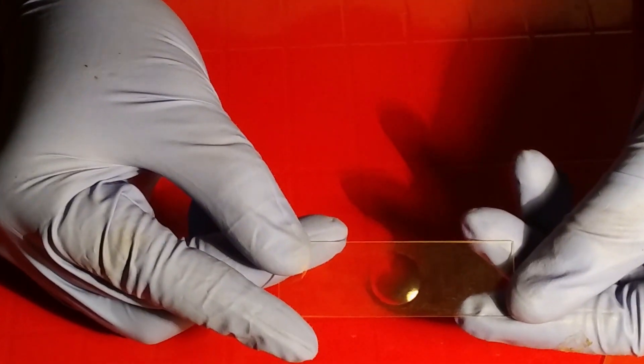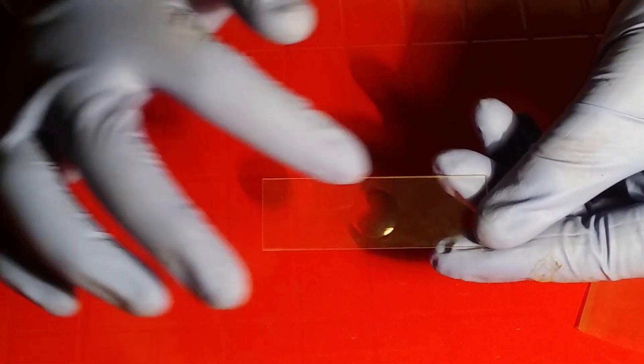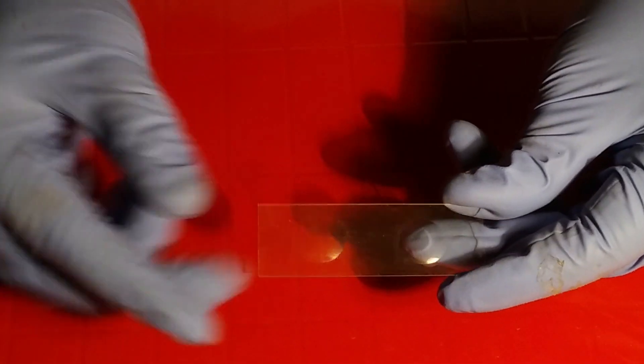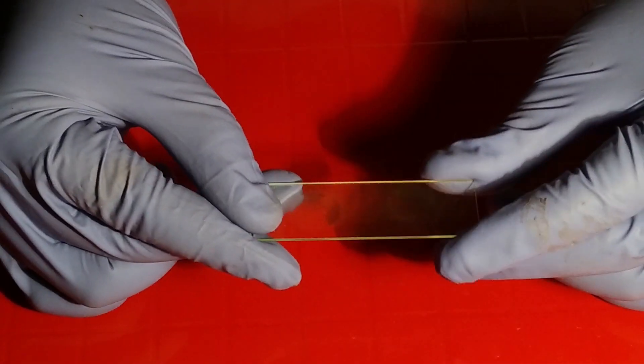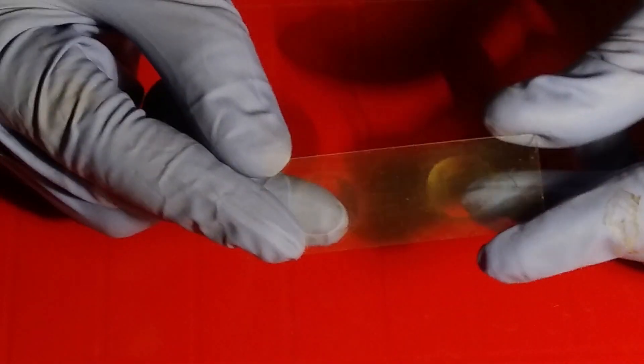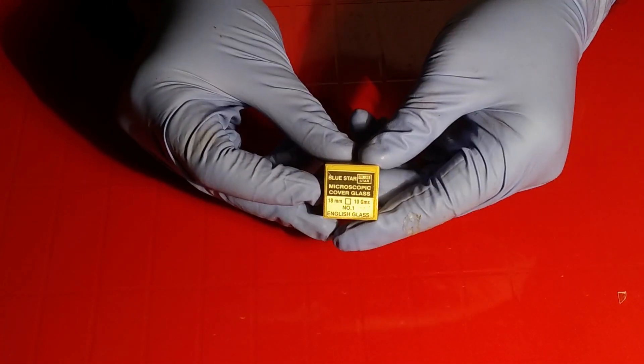This is a slide having a groove — look at the groove area in the slide. The zoomed view shows a single groove, and this one is a double-groove slide. While having staining-related practicals in botany or zoology, these groove slides are very useful.